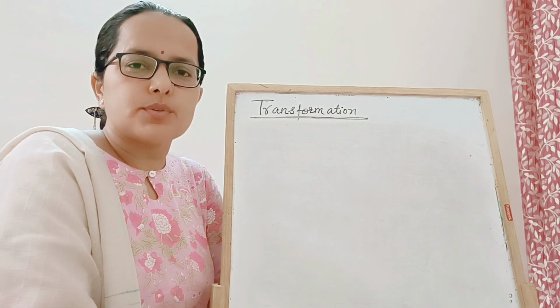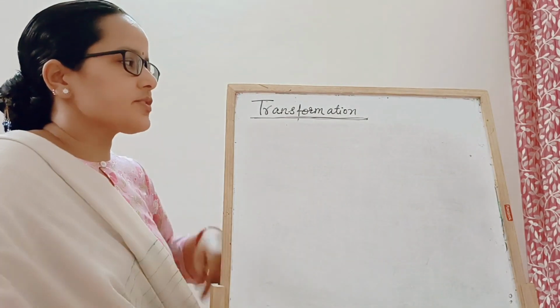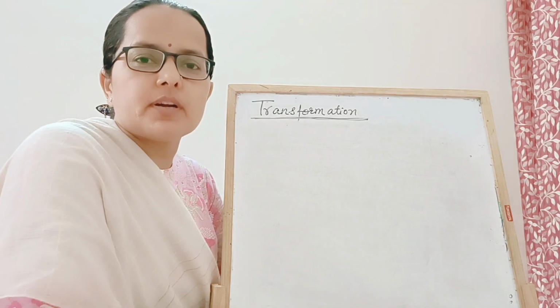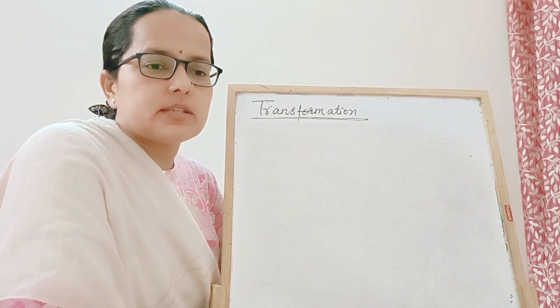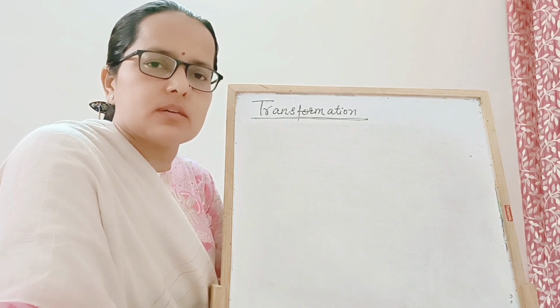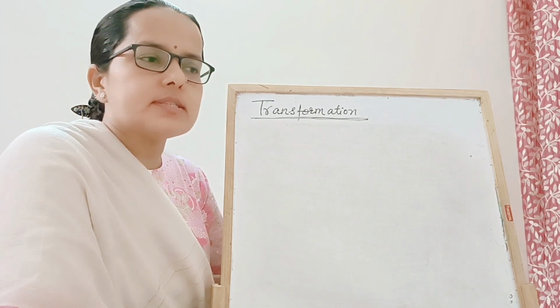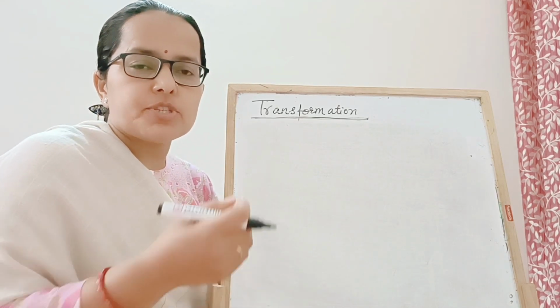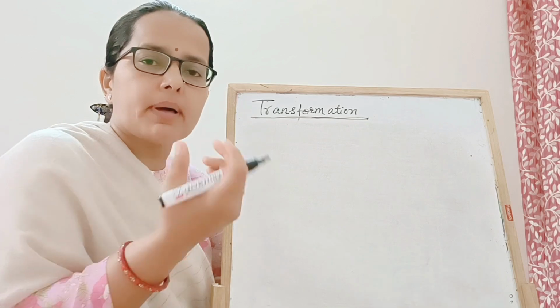So hello friends, to start with the next lecture, that is transformation. In the previous lecture we learned how to prepare competent cells, and today we will learn transformation. What is transformation? Transformation is transferring a genetic material to a cell. That is transformation in simple language.